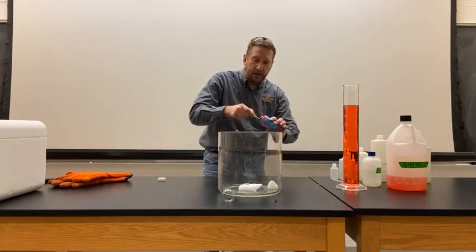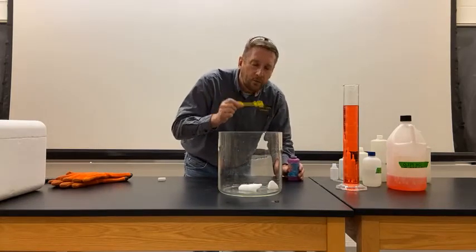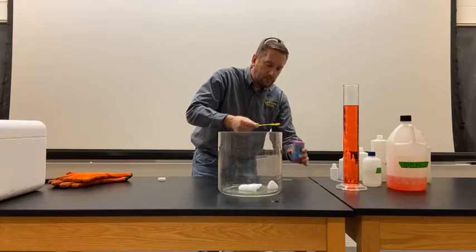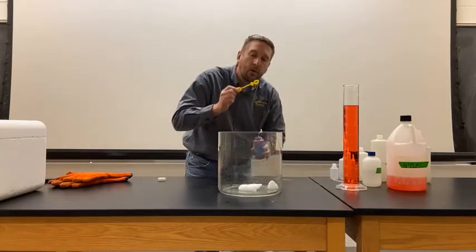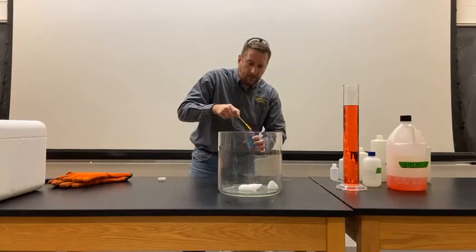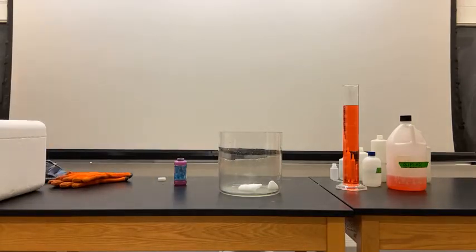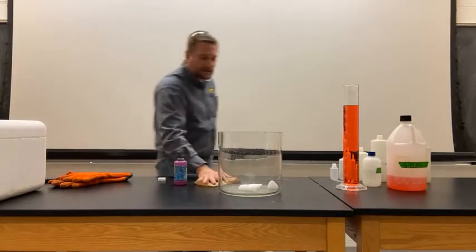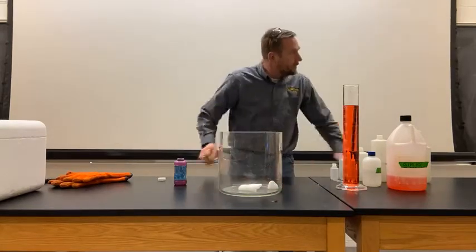Well, now I overshot it. Here we go. Well, we made it in, but, okay, one second. I've made a mess on the countertop here. Let's try again. Let's see if we can get some better bubbles.